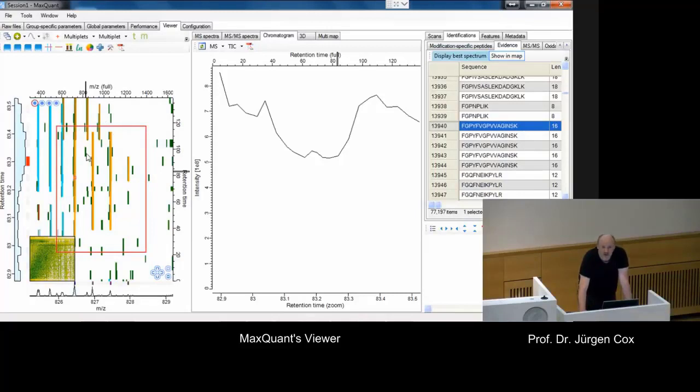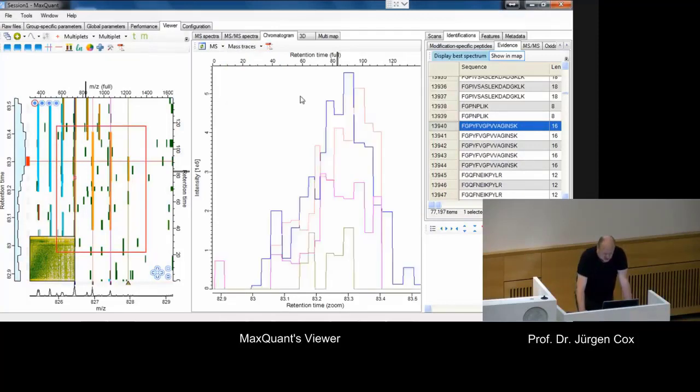But what you also get, here on this bottom bar, is 4 positions marked. Does one see that? So there, you see these 4 positions marked. And you can also have vertical lines at these positions. And what you can see in this view are the intensity profiles at exactly these mass values that are marked here.